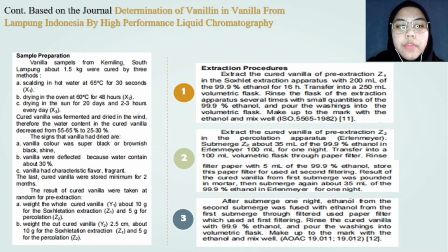About 1.5 kg of vanilla sample was cured by 3 methods: scalding in hot water at 65 degrees Celsius for 30 seconds, drying in the oven at 60 degrees Celsius for 48 hours, and drying in the sun for 20 days, 2 to 3 hours every day. Cured vanilla was fermented and dried in the wind. Therefore, the water content in the cured vanilla decreased from 55 to 65% to 25 to 30%. Then, cured vanilla was stored for a minimum of 2 months. And lastly, the cured vanilla was taken at random pre-extraction.